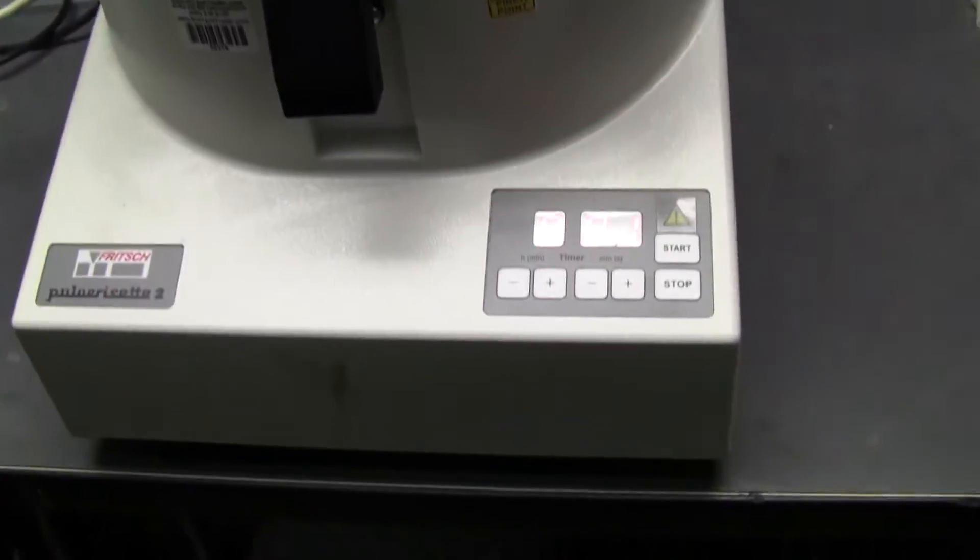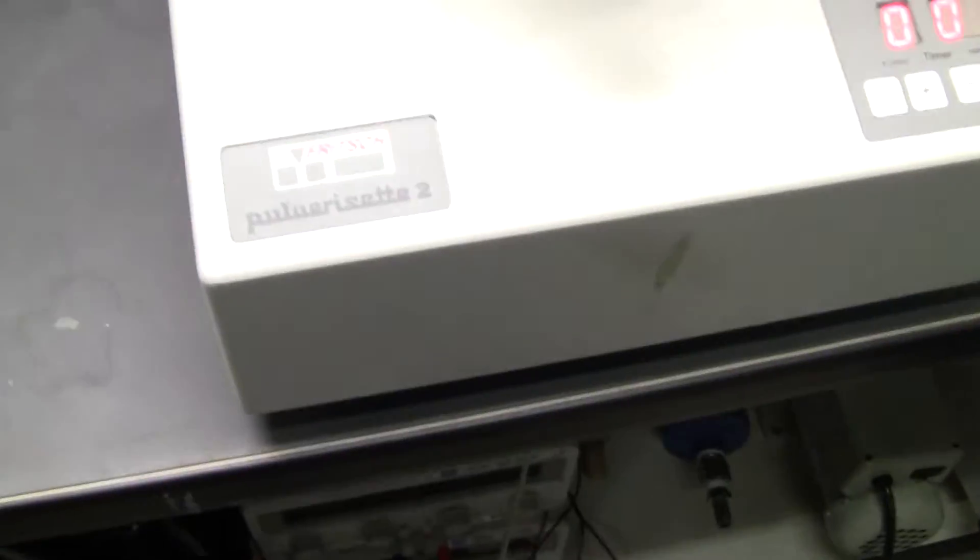Hi, this is Michael Natow from Hitech Trader. Today we're looking at the Fritsch Pulverisette number two.